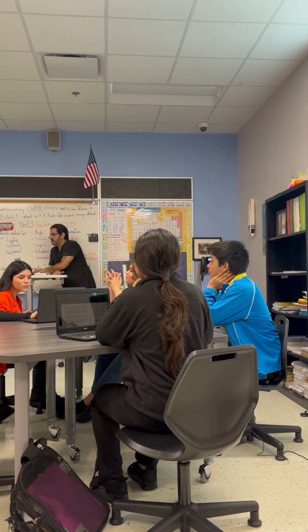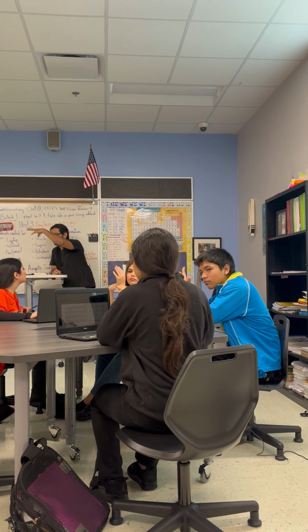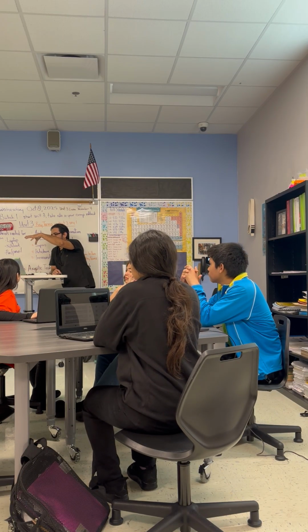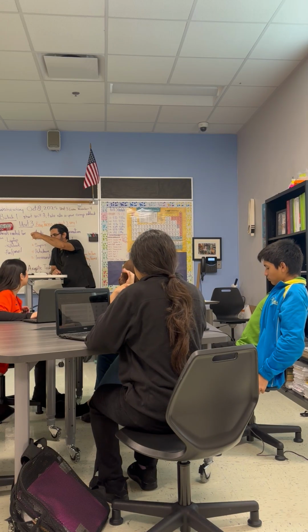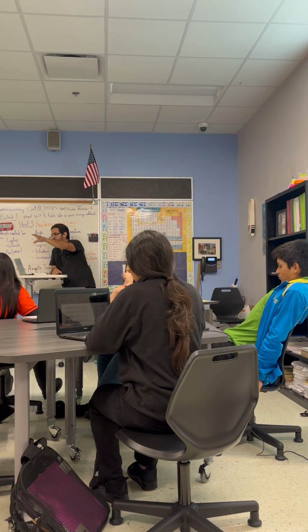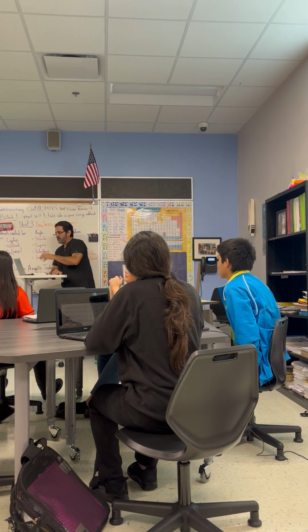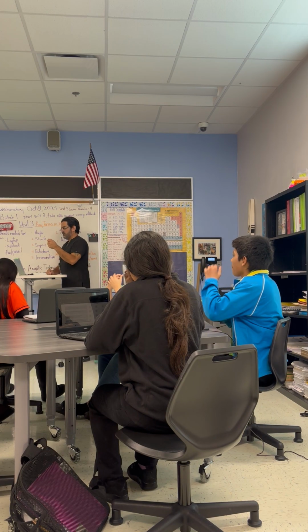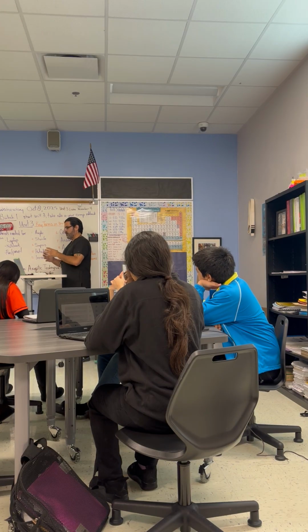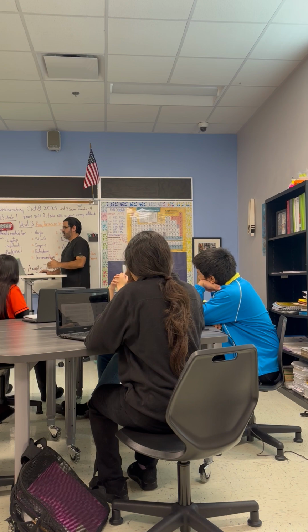Okay, now, the aseptic culture, so those plates that were growing back there, that have the lid on them, remember I told you guys that we're going to work to isolate one specific type of bacteria, right? That's our goal. Those plates have maybe 3 or 4 different bacteria growing at one time, but we want to isolate one and streak a brand new plate and grow it. Aseptic technique is crucial for that.